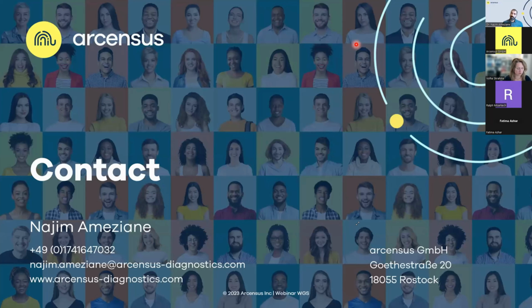And even if you detect one, it's always recommended to do a confirmation, just to establish and confirm the size of the repeat, which can be done much more accurately with the gold standards instead of using whole genome sequencing. It will give you a hint that there is indeed a repeat expansion. Nevertheless, the size of the expanded region is not that accurate, and therefore it is important to do a confirmation of the repeat expansion.